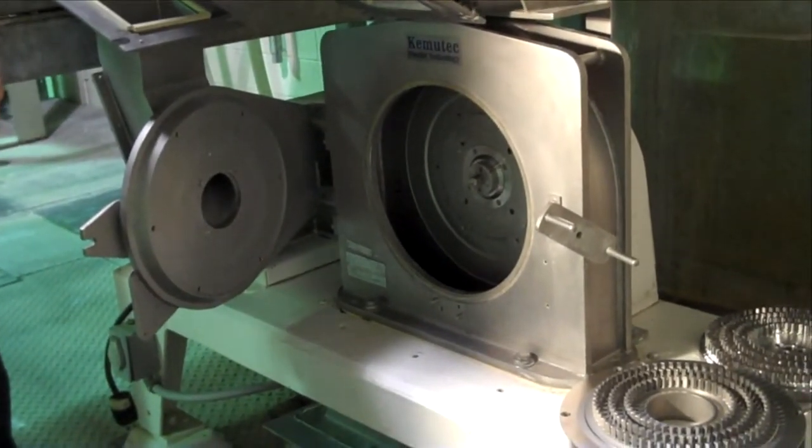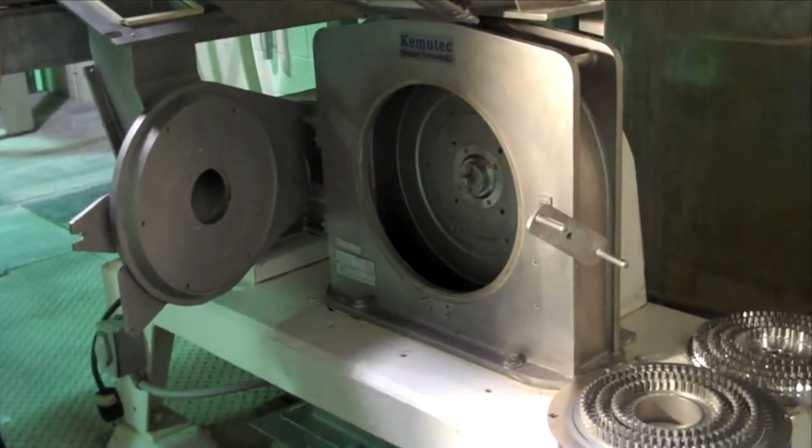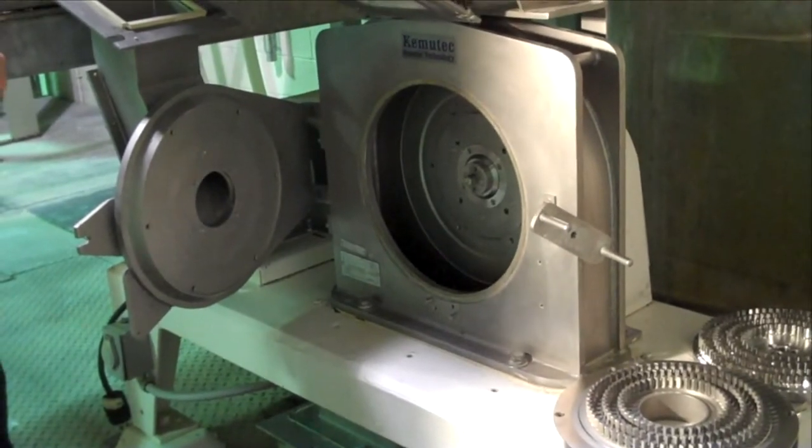This grinding mill has no grinding media fitted yet and we're about to show the interchangeable media.